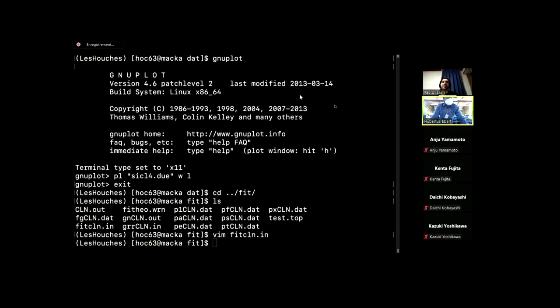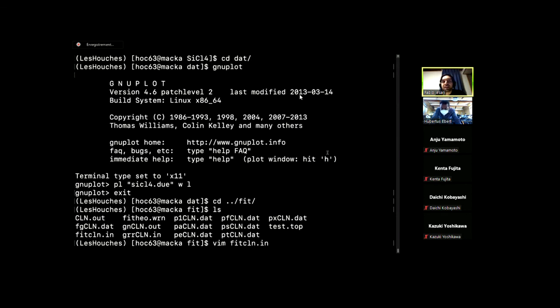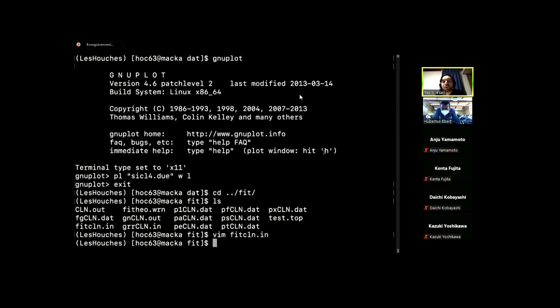But maybe if you use another version of Fagen that can calculate only for a given angle, then I think GNXAS can use the output of Fagen as input. But as far as I know, we didn't try this one. Okay. But it could be something to think about. So thank you. Yeah, most welcome.